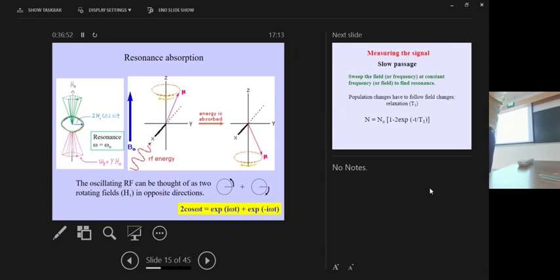There are therefore two tiny magnetic fields, whose amplitude is H1, and one of them goes in this direction, the other goes in the opposite direction. So these are two opposite rotations of this H1 field. Now, all the spins are going in a particular direction. This is called the nuclear precession, as I told you. Suppose you sit on the RF and look at these magnetic moments. You look at the one which goes in the same sense as your nuclear spins. Then you will see that this is going at a slower speed. If you sit on the opposite one, it is going at a much faster speed. But you want to sit on the one going in the same direction and look at the nuclear spin. If your nuclear frequency matches the frequency of this RF, cosine omega t, then that nuclear spin will appear stationary.